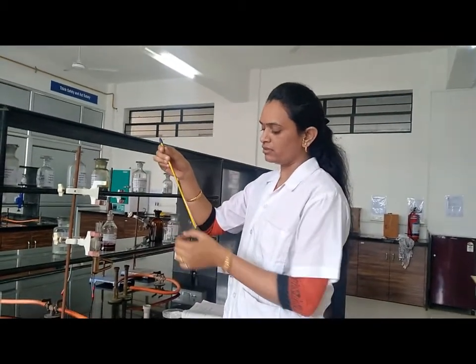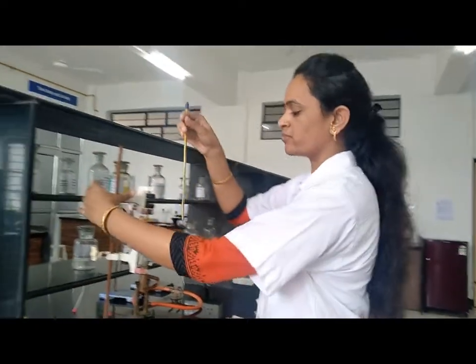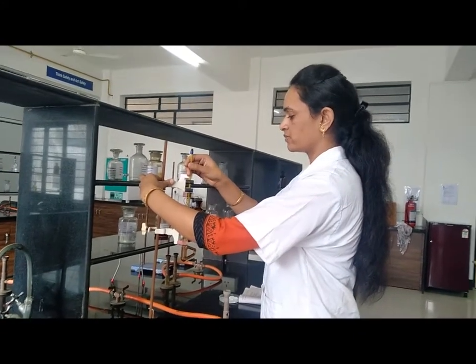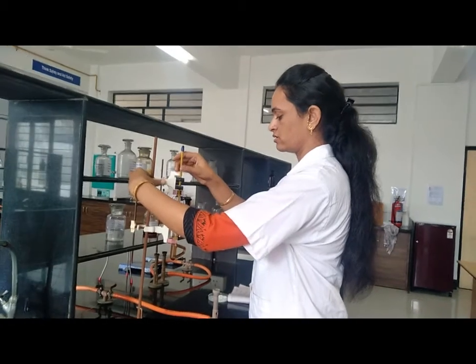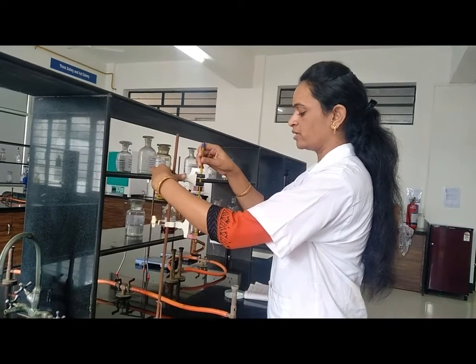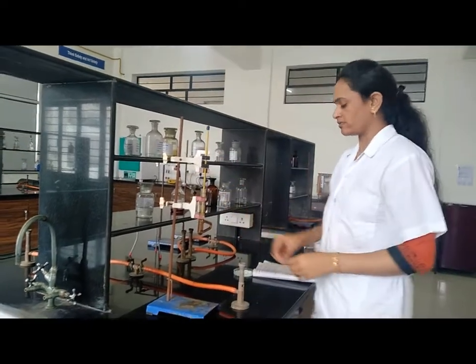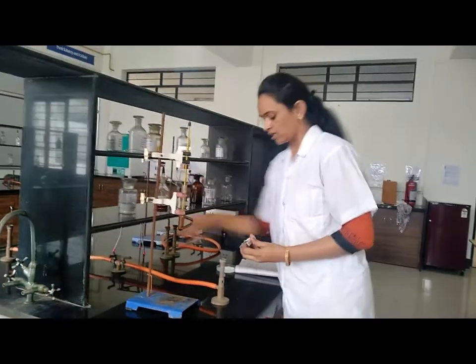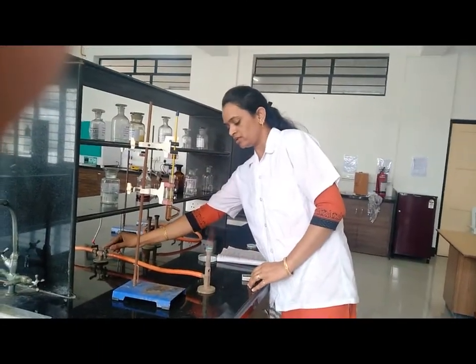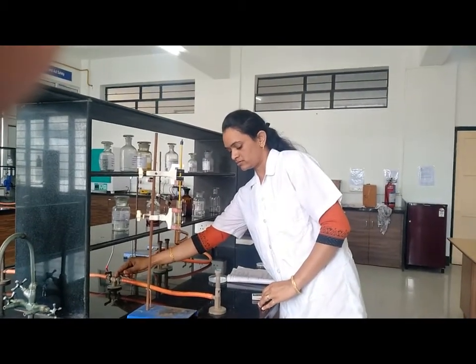We are tying the capillary tube containing the solid organic compound to the thermometer, and then immersing this thermometer with the solid sample in the Thiele tube containing liquid paraffin. Only 50% of the capillary tube should be immersed into the liquid paraffin. Then start heating on a low flame, so that even and constant heating is provided to the Thiele tube.